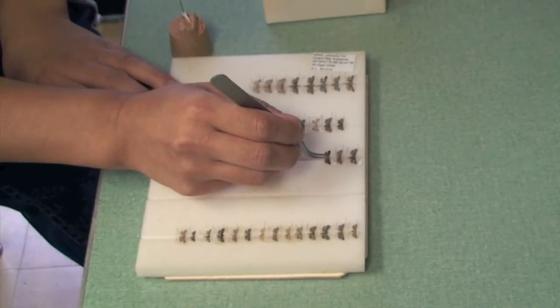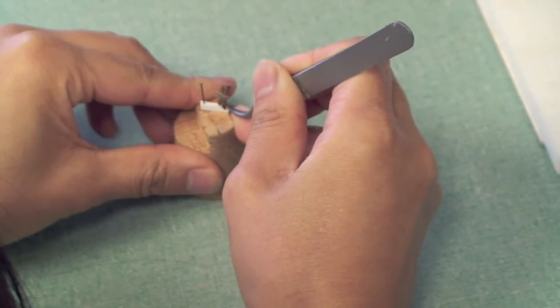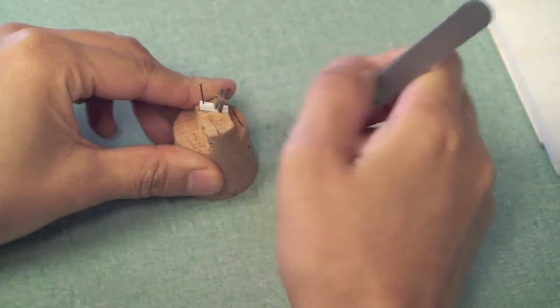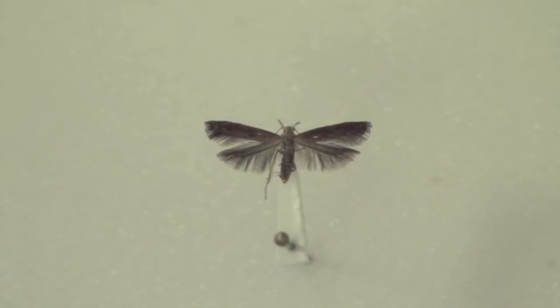The pinned specimen can now be double mounted on a strip of silicon rubber that's cut diagonally from a square strip so that it's triangular in shape. The specimen is now ready for labeling.